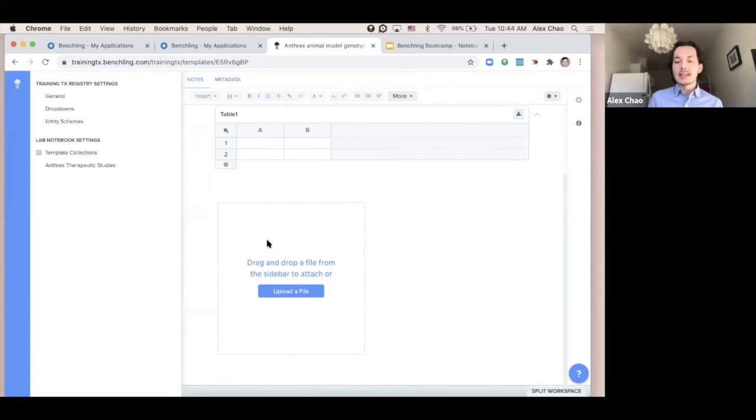So as you're able to see, many of you said that you're going to utilize entry templates for data collection standardization, and that's certainly a great way to leverage this feature. You're able to put in areas where users can input exactly the data that they're collecting in a structured manner, such that it's standardized across your team.